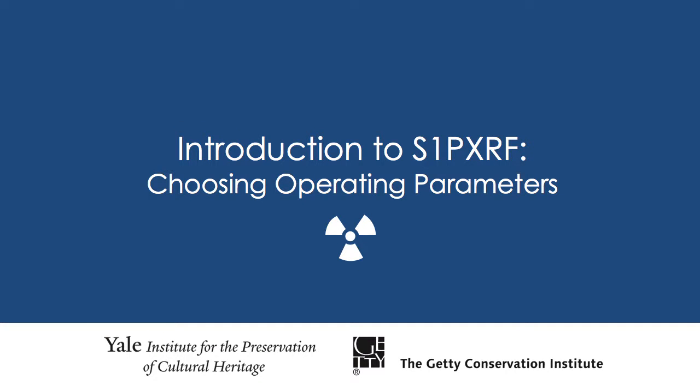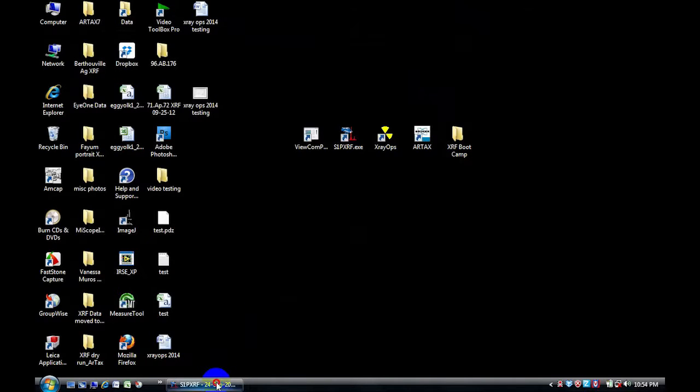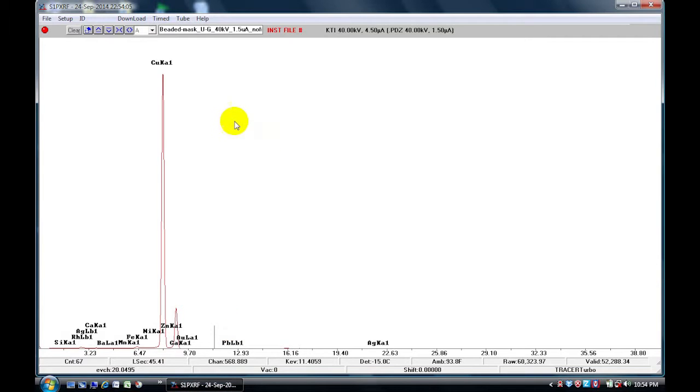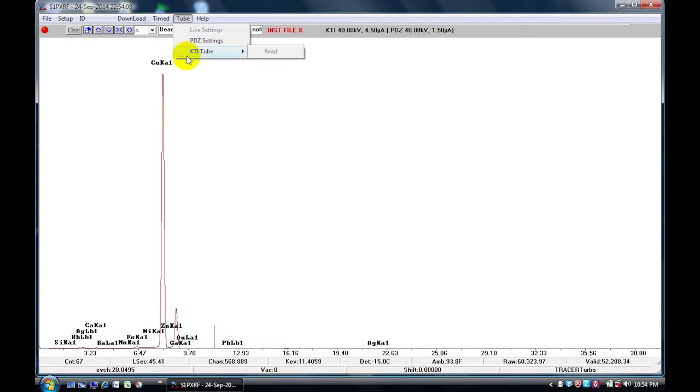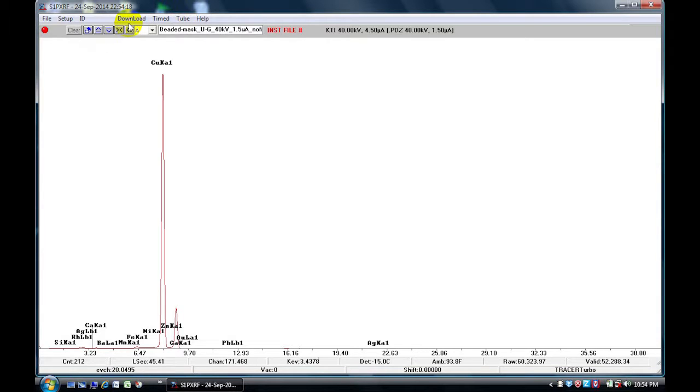And now we are ready to start the S1PXRF software. Double click on the shortcut. Now if you go to tube and KTI tube you will notice that the read is grayed out, it's not activated. Also notice that we have a red button. So the software is not ready yet.